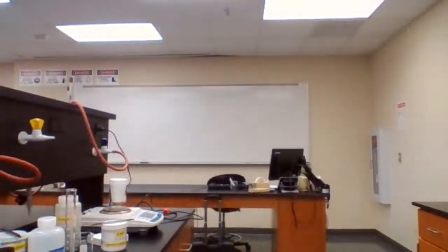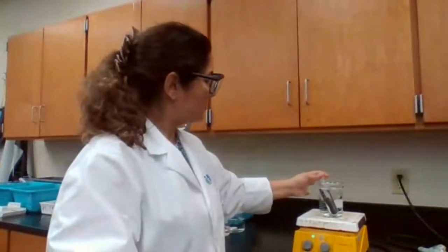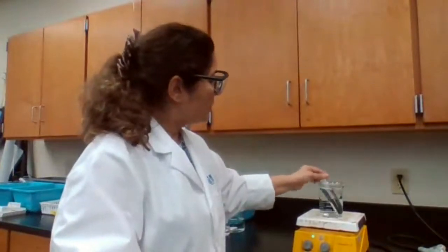Going to place the copper inside the boiling water and keep it there for 5 minutes. So it's asking for the mass of water, which you get by difference.